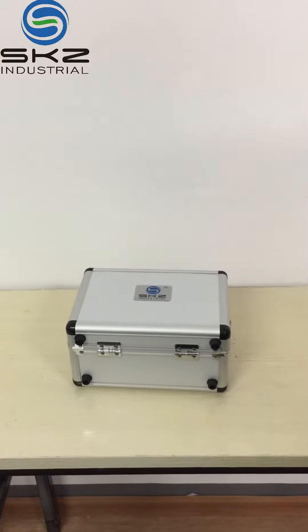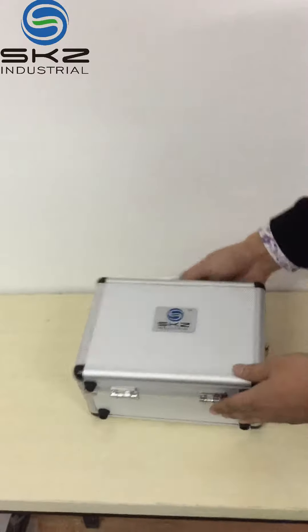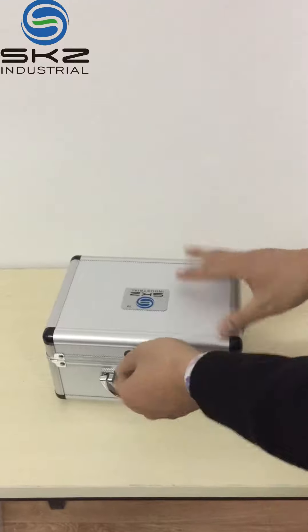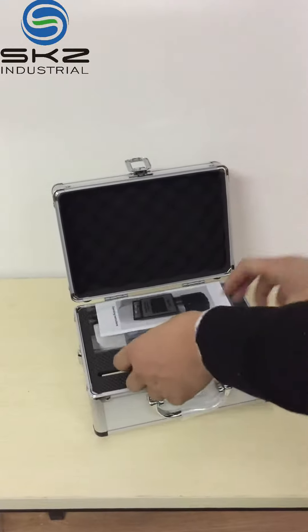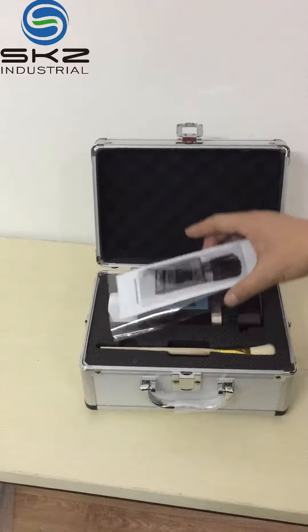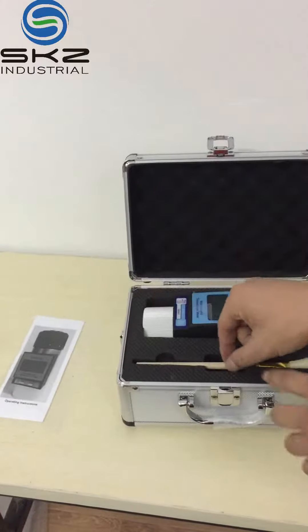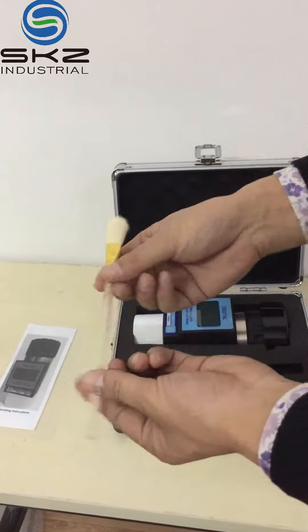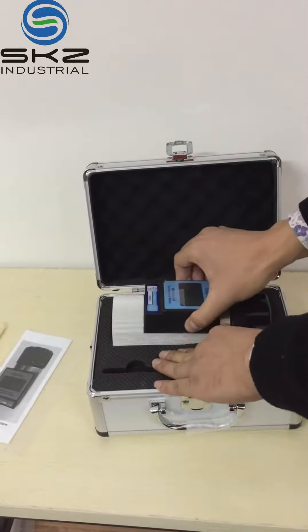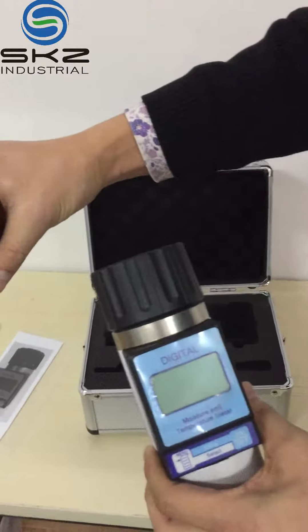SKD 111B plus 2 gray moisture meter. This is the bag. This is the tie for the bag. This is the operation manual. This is the brush. This is the sample cup.